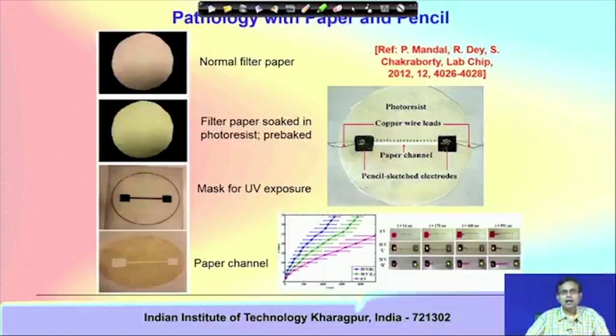You apply a basic 2-step process. In the first step, you print the microchannel design on the piece of paper on both sides with the inkjet printer, and in the second step you heat this system on a hot plate.